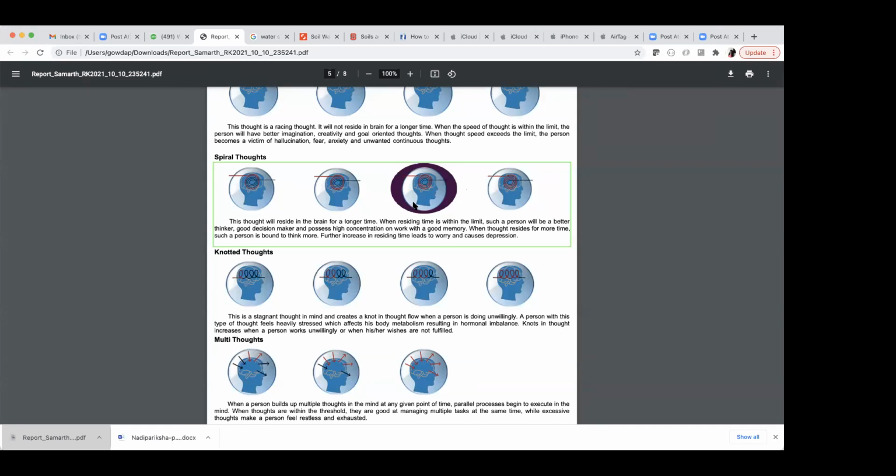In the upcoming report, we are removing all the others and keeping only this one. I missed that part because I took a black and white printout. You can see it in the software itself when you download, and when you're sending through WhatsApp, you can open and see it on the mobile itself.